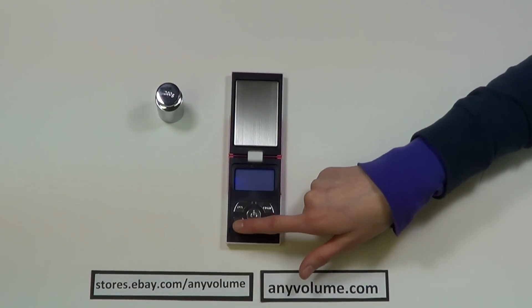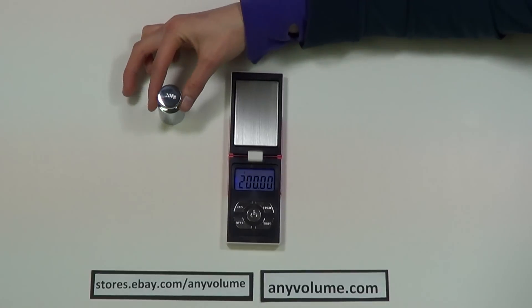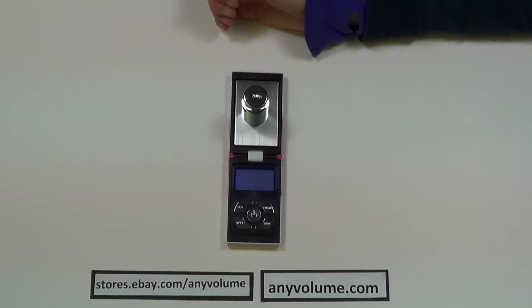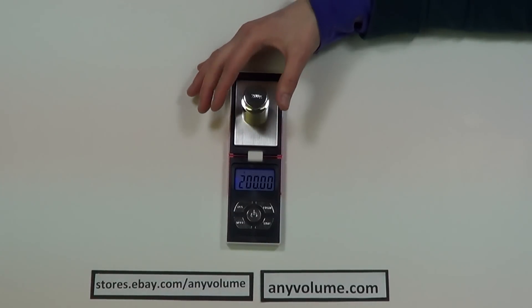Then press and hold it again and it will start blinking and then display the weight of 200 grams. That's when you place your 200 gram calibration weight in the center of the platform, and you wait for the display to say PASS — that's when you know it's done.